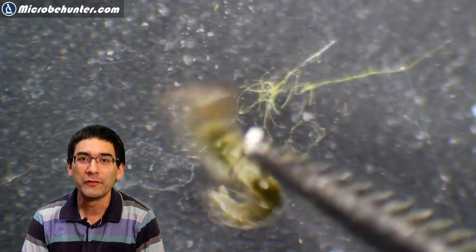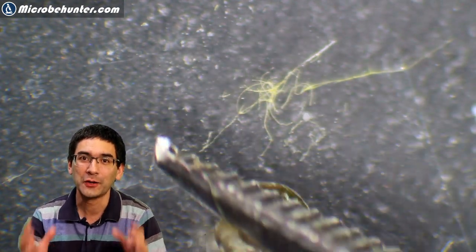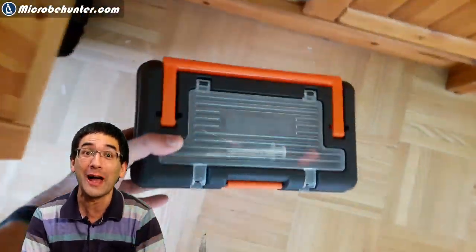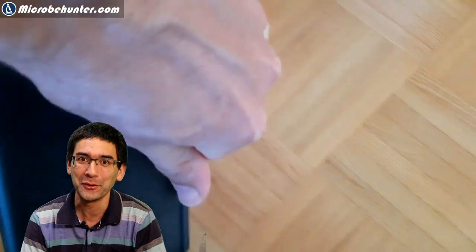This is the larva of a mosquito. I got it from pond water, and today I'm going to show you how I collected it and how I put it under the microscope.